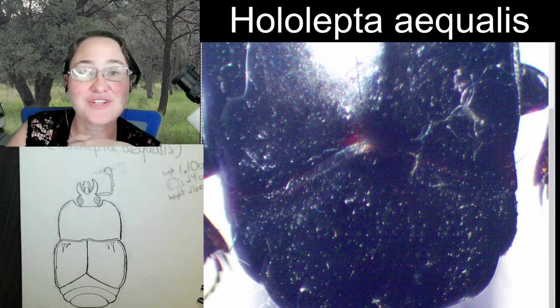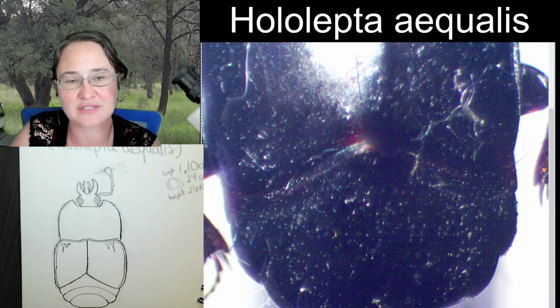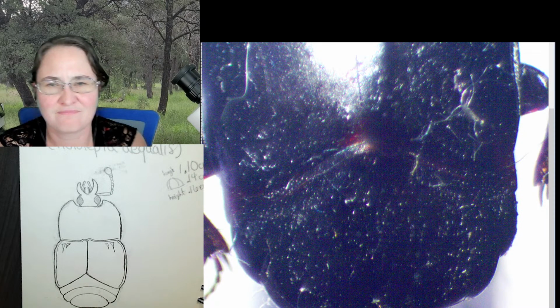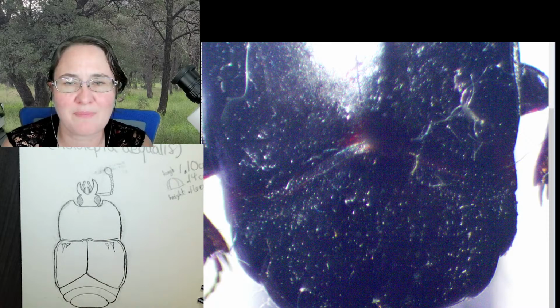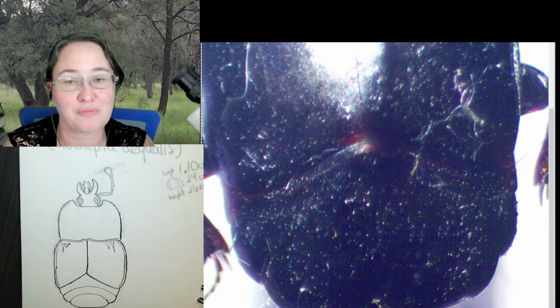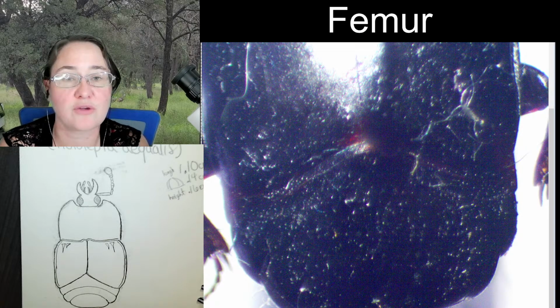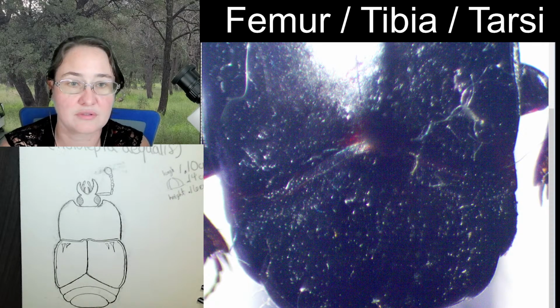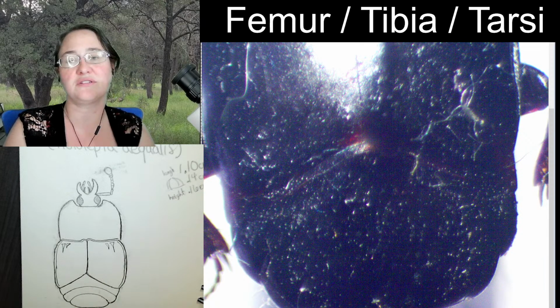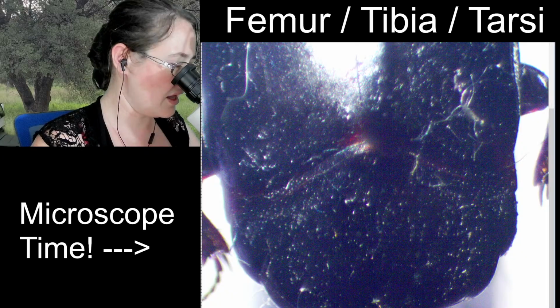Now, the legs are really cool on this beetle. They've got all of these kinds of crazy looking tibial shaping. And it's for pushing themselves underneath bark so that they can go and predate upon little beetle grubs. Just to let you know, I'm going to give you our leg words: femur, tibia, and tarsi. Those are the major parts of an insect's leg.